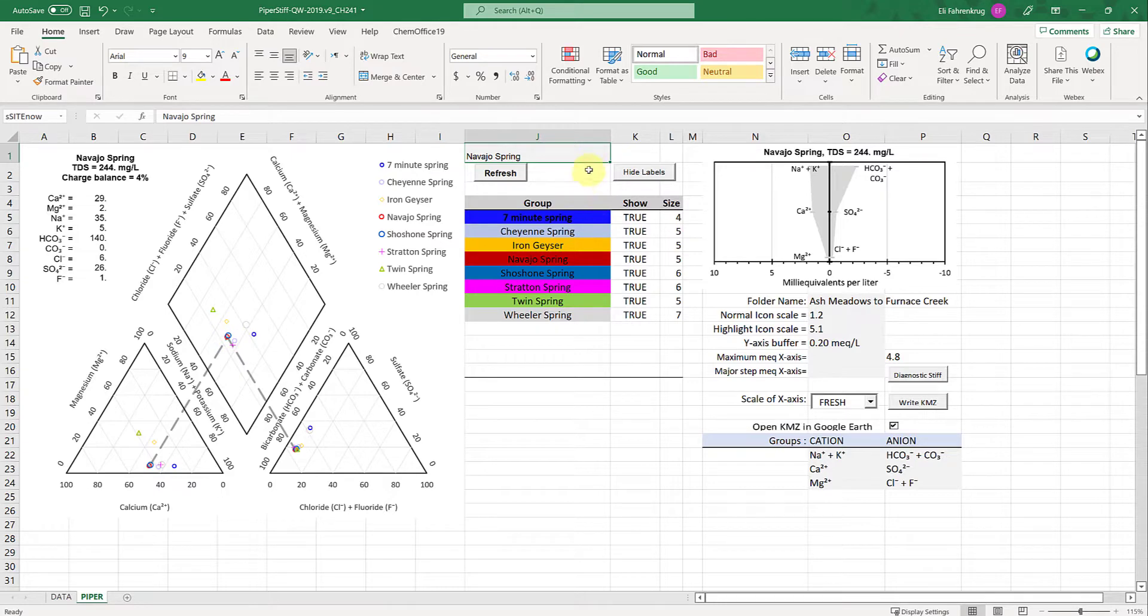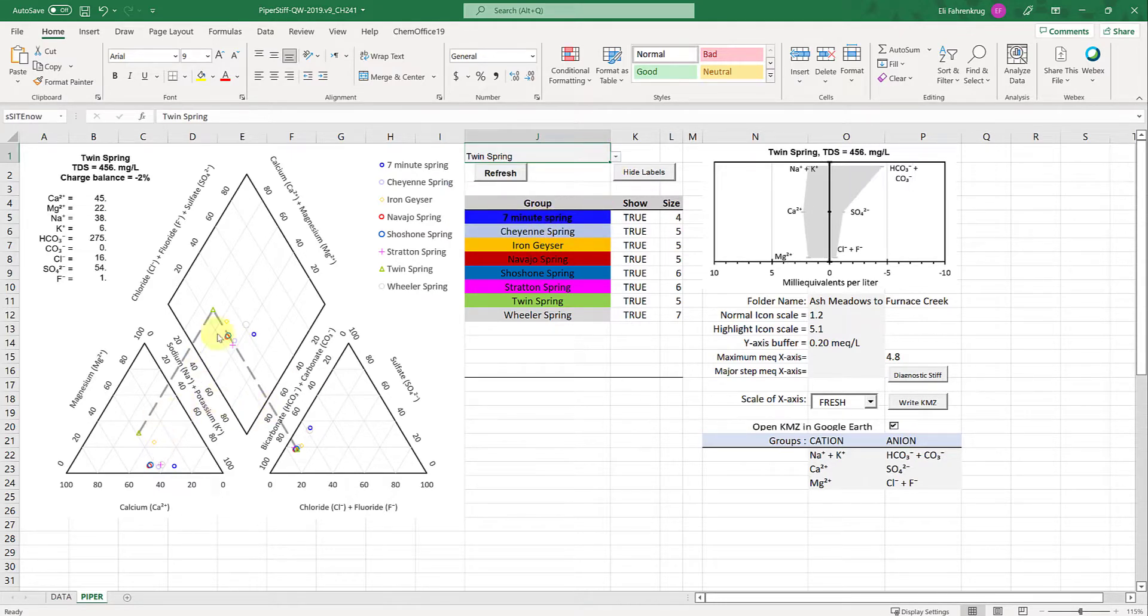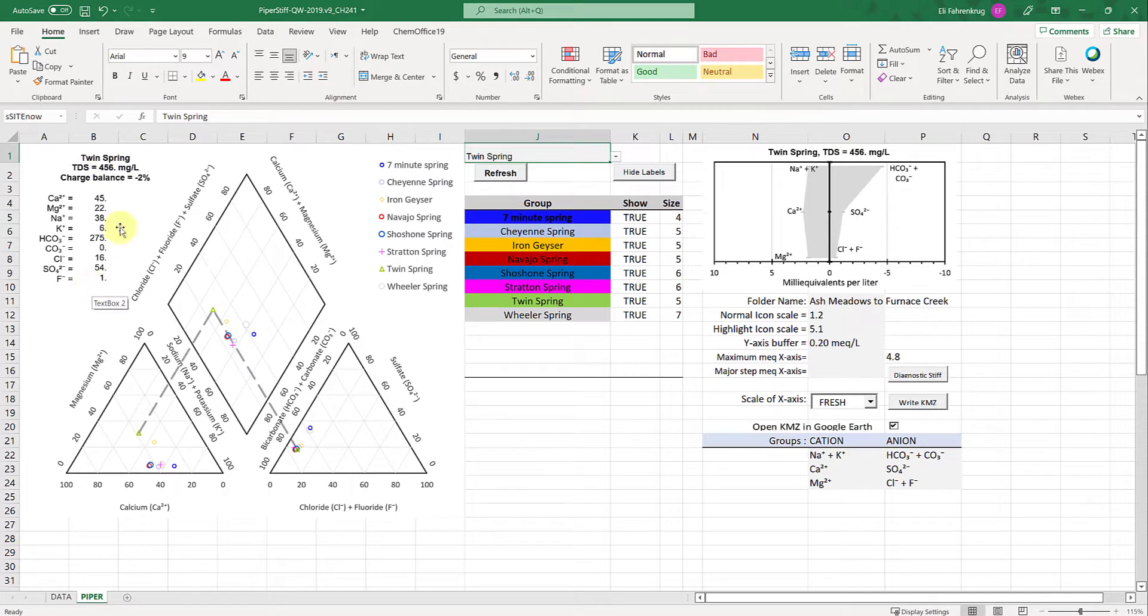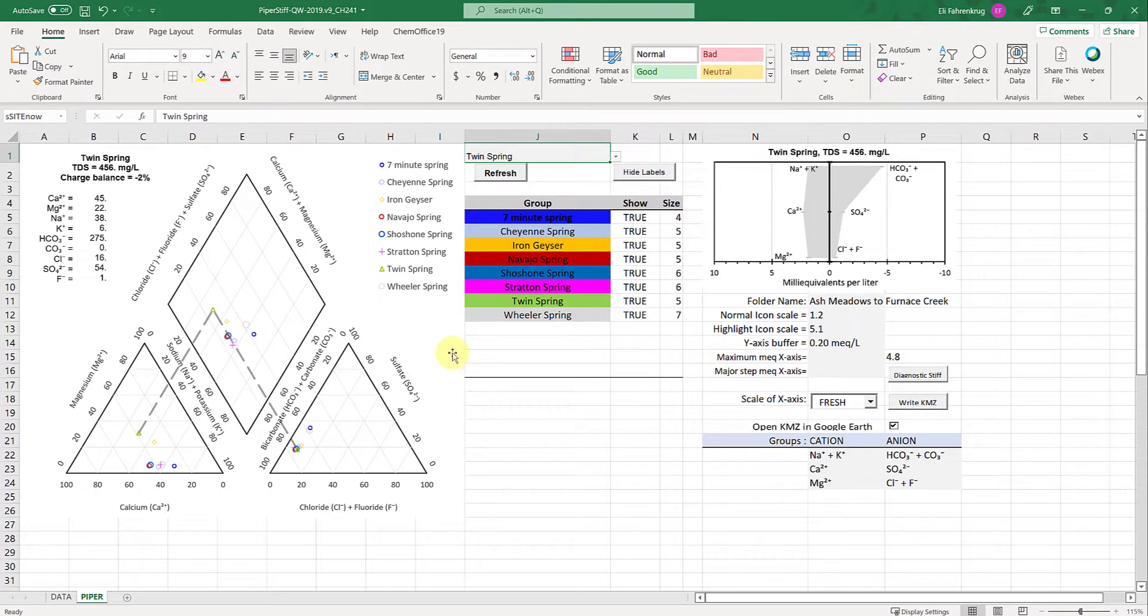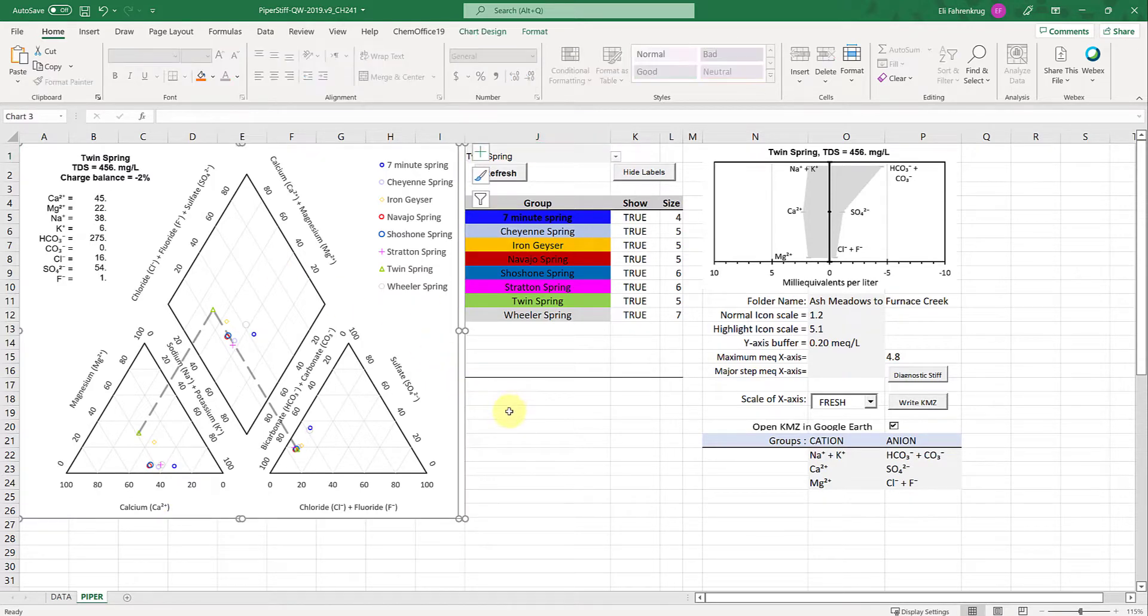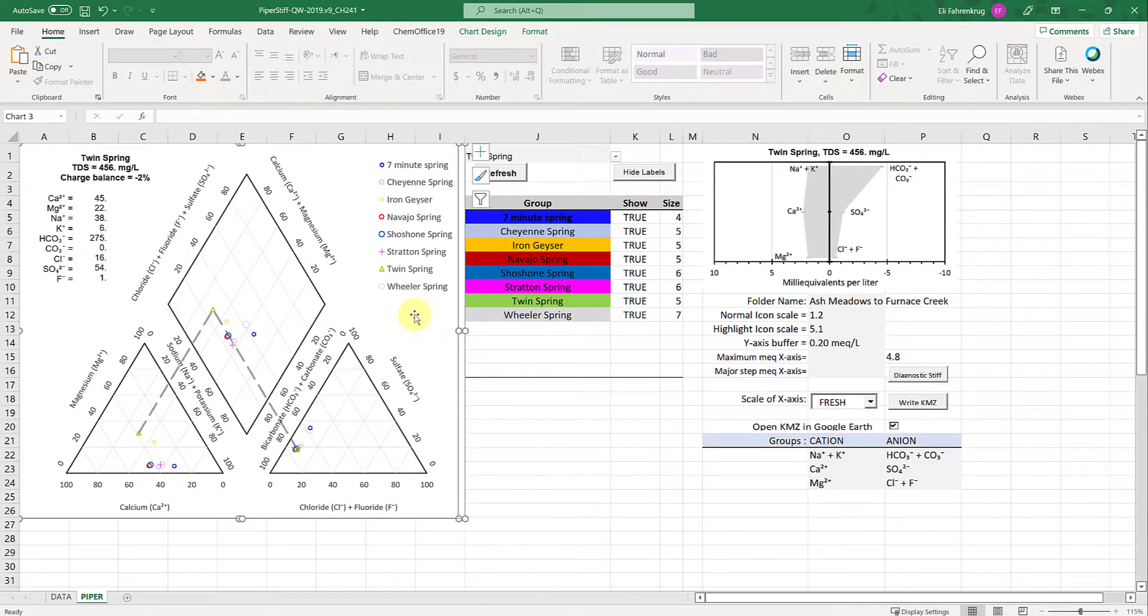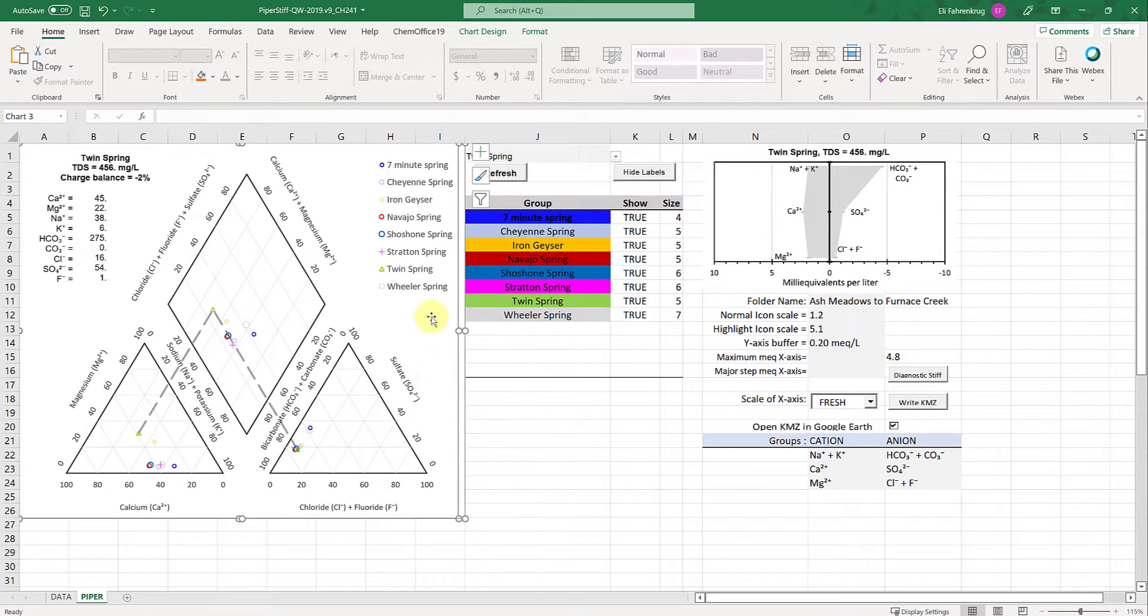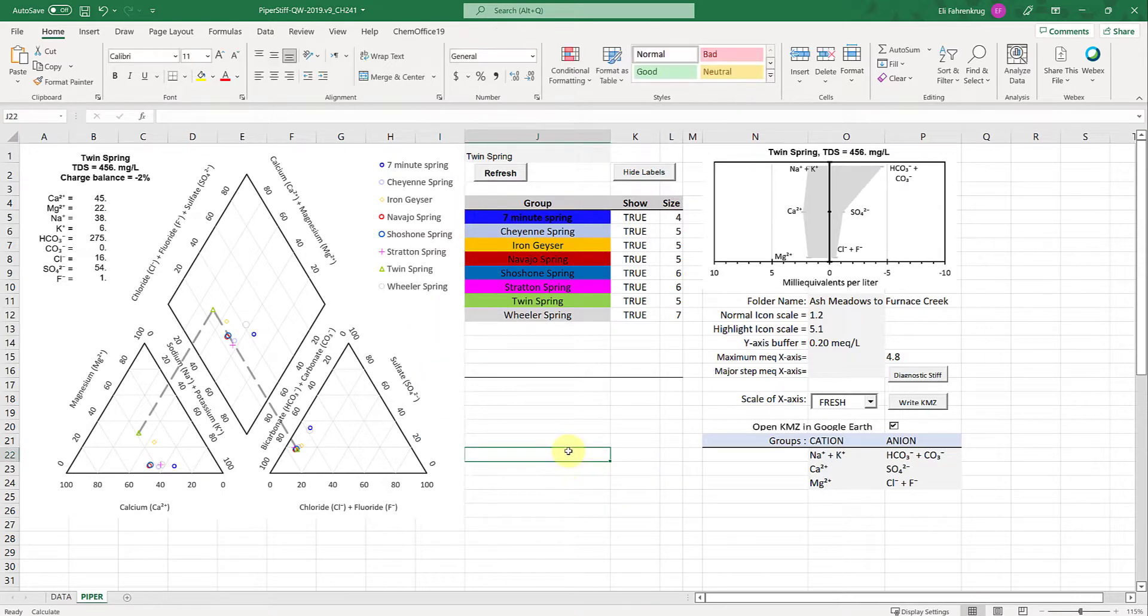I can change this to whatever I want and the lines change. Those individual values are also populated here so you can see here's twin spring, here are the specific ion concentrations, charge balance, total dissolved solid, etc. This is a really powerful tool. If I want to capture this for a presentation, I can right click or choose ctrl C, or take a screenshot and paste it.